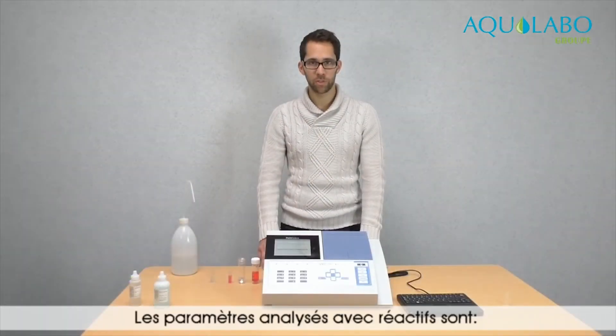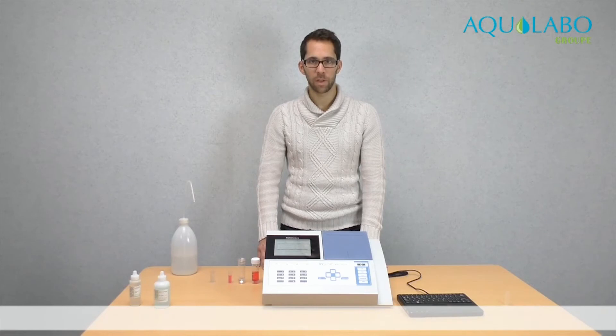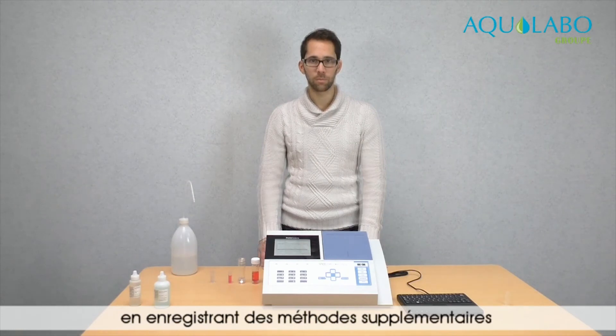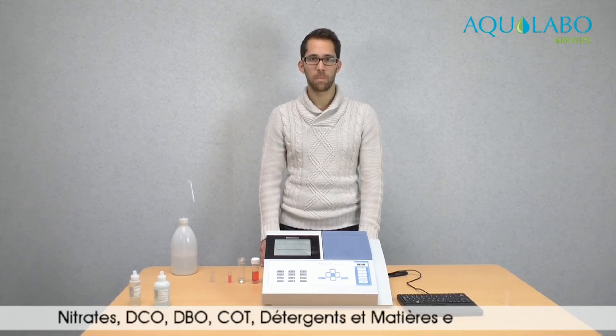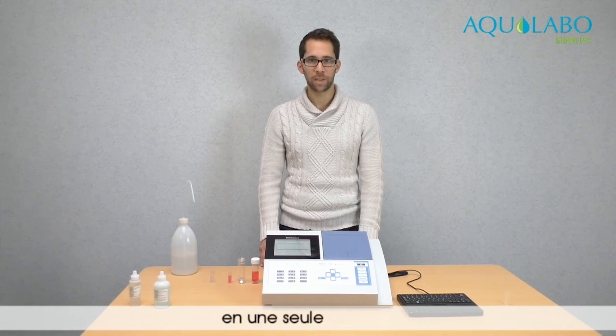The parameters measurable with reagents are nitrates, COD, phosphates, ammonia, and total nitrogen. However, if you wish to measure other parameters, you can record new methods. The parameters measurable without reagents are nitrates, COD, BOD, TOC, detergents, and suspended solids. It is possible to measure all of these parameters in just one analysis.